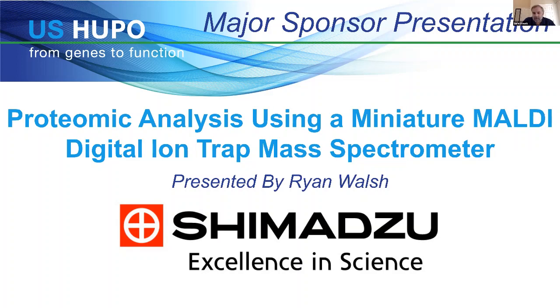The question was brought up, can you do MALDI imaging using this system? I guess that would come down to how quickly you can acquire data. At this time, the system does not do MALDI imaging. However, it's potentially possible that that might be one of the plans for the future.